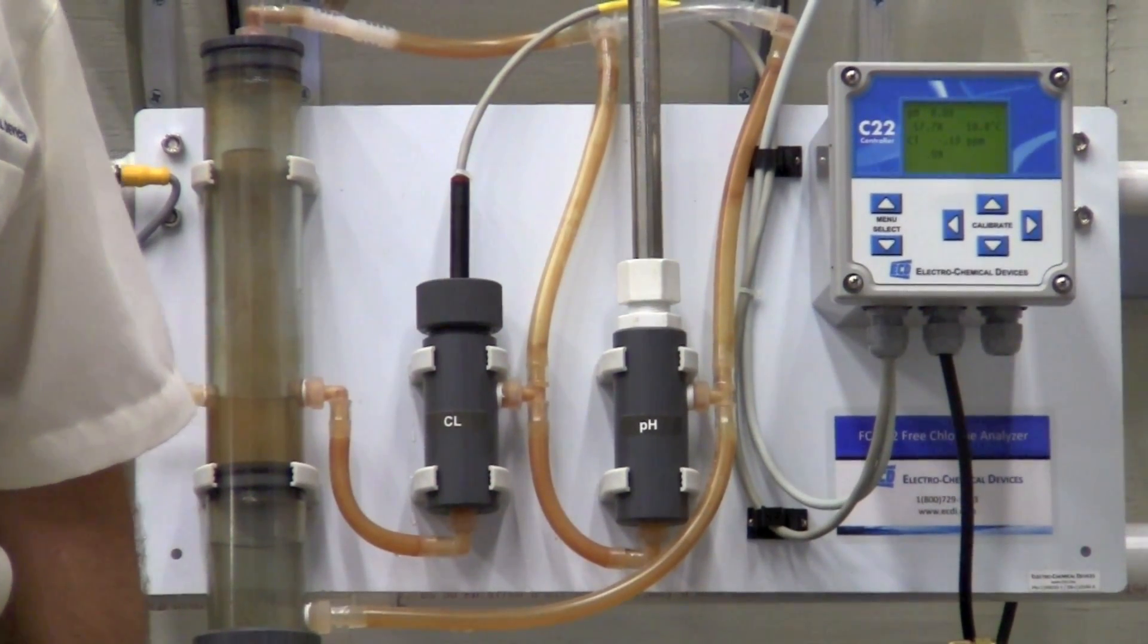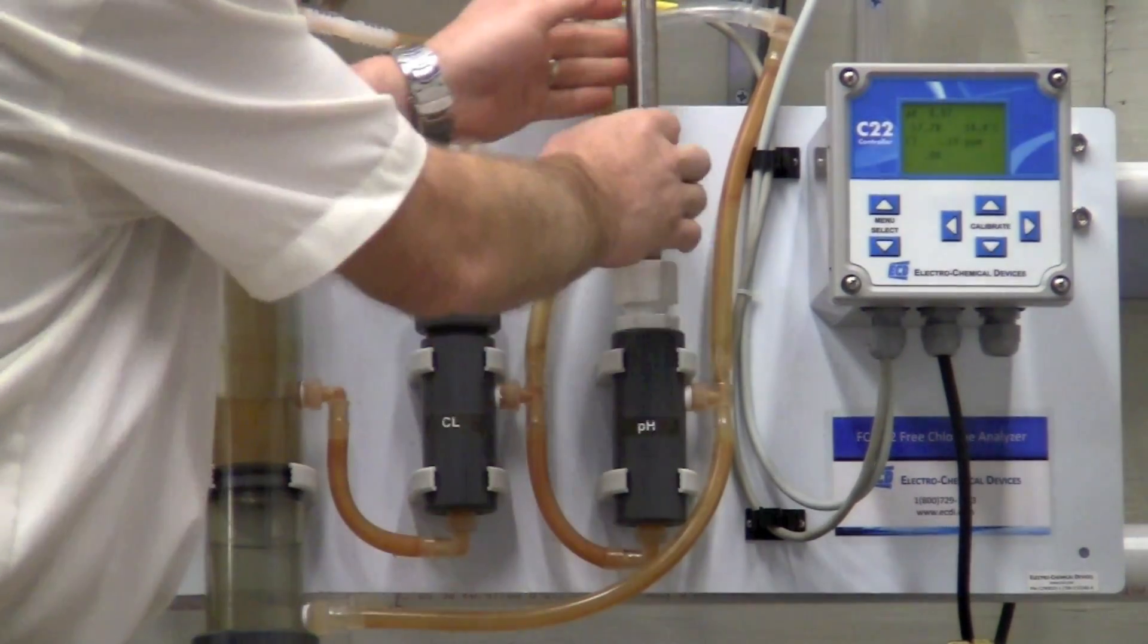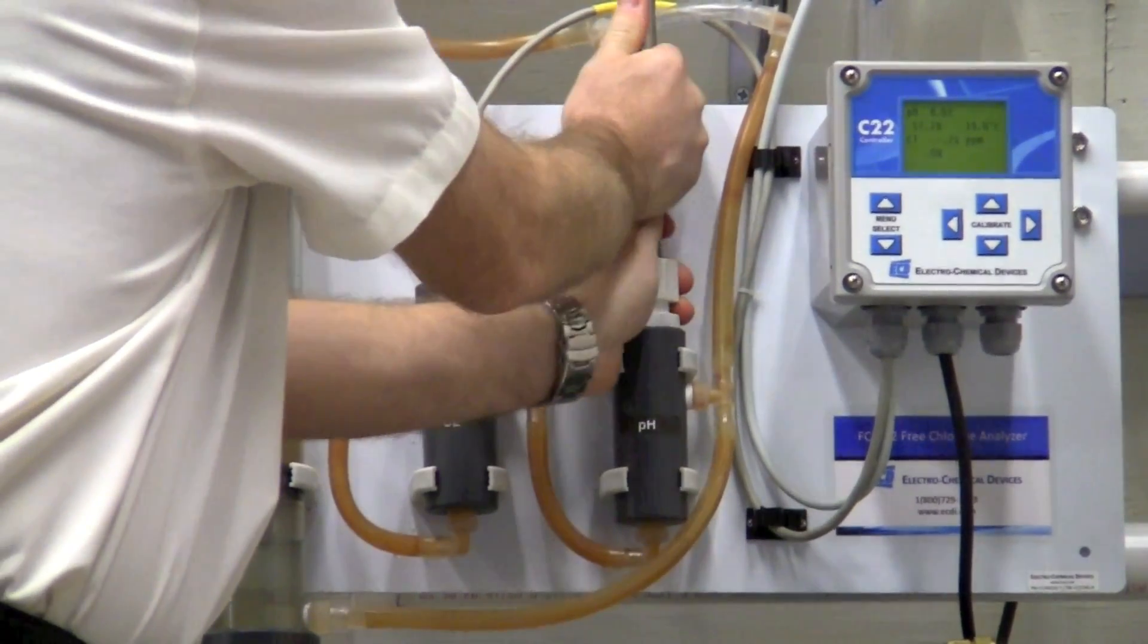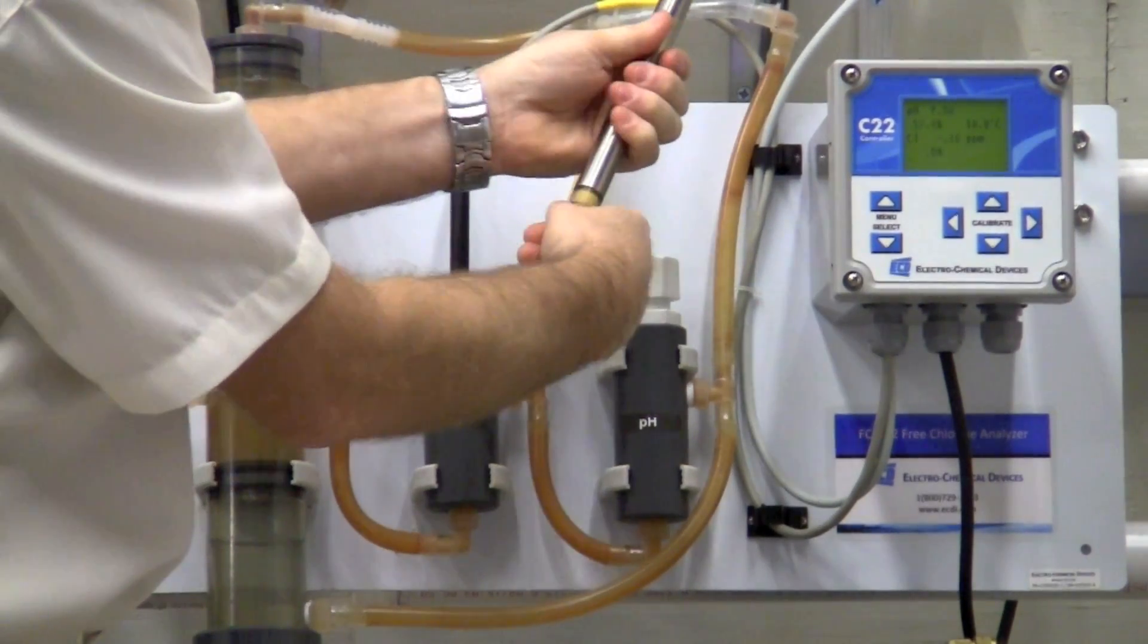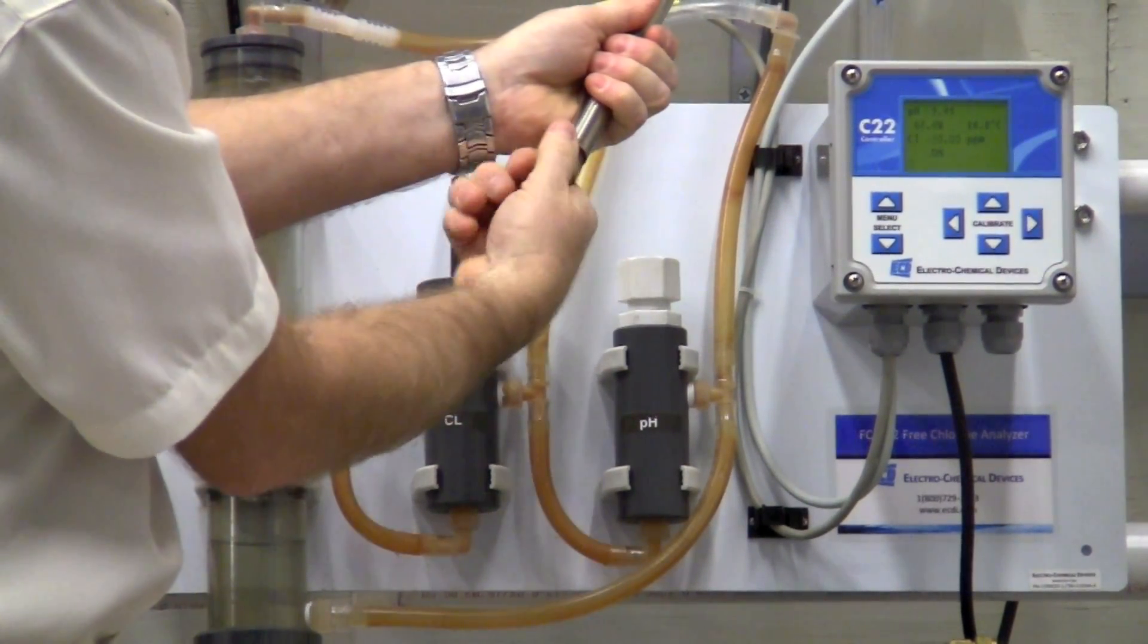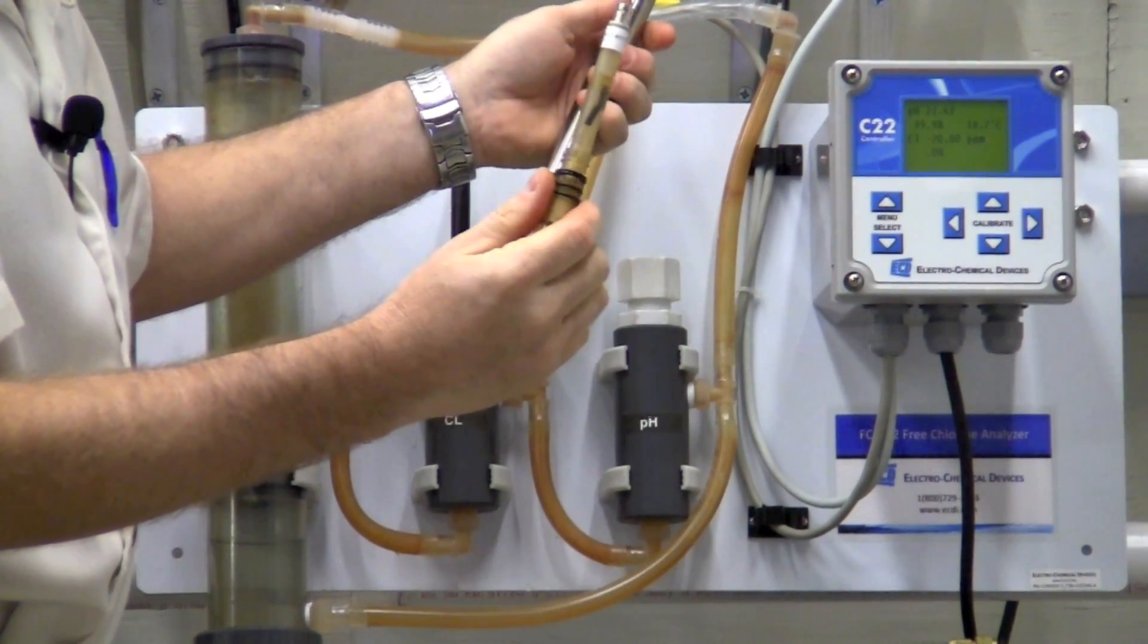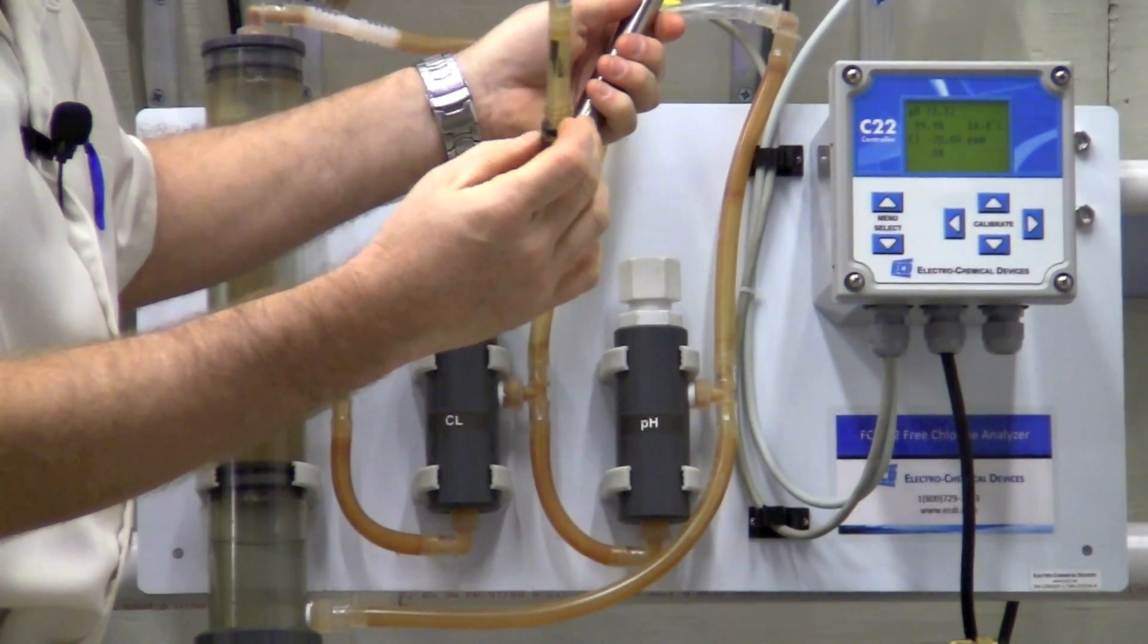Maintenance of the pH sensor is a yearly replacement of the pH electrode. A new pH electrode is one hundred and forty dollars for this general purpose pH electrode.